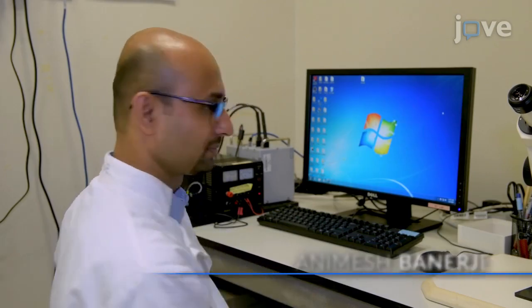The unique thing about FLLIT is that it does not require any user-annotated datasets for training and is hence fully automated. FLLIT also automatically analyzes the track data, producing a series of gait measurements, gait plots for visualization, and a track video. Demonstrating the procedure will be Animesh Banerjee, a postdoctoral colleague from my laboratory.